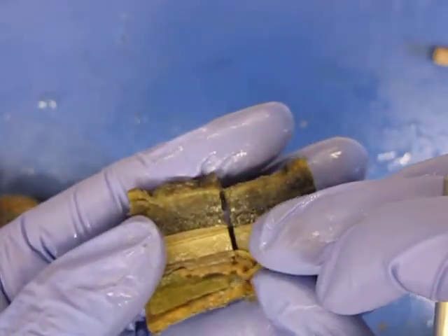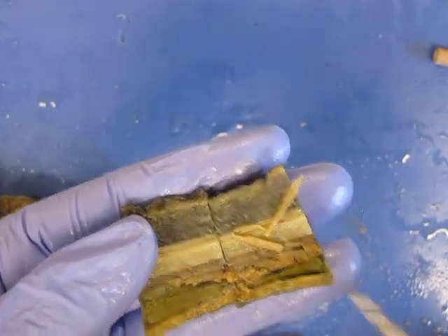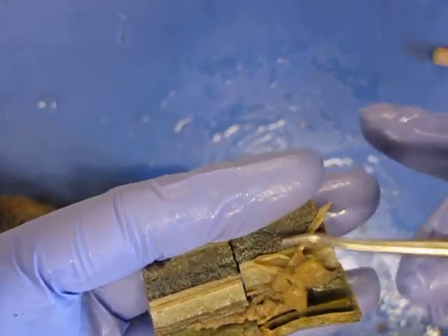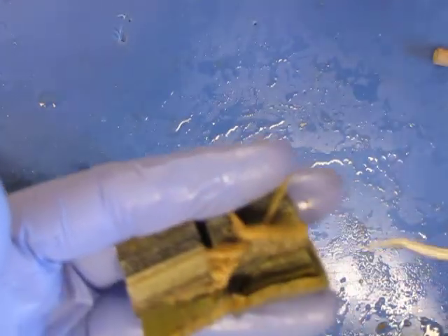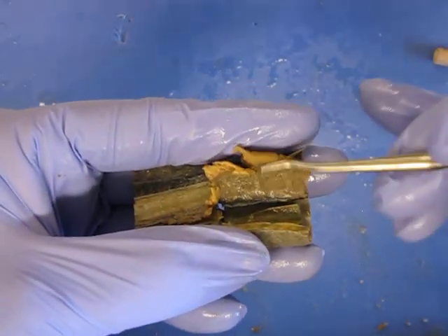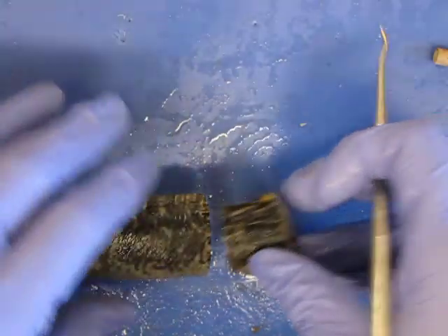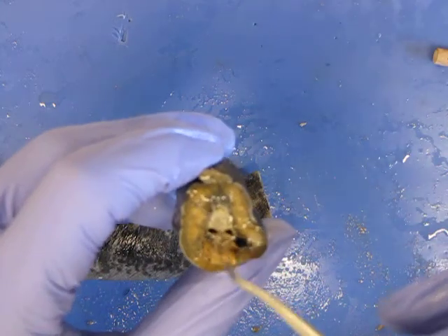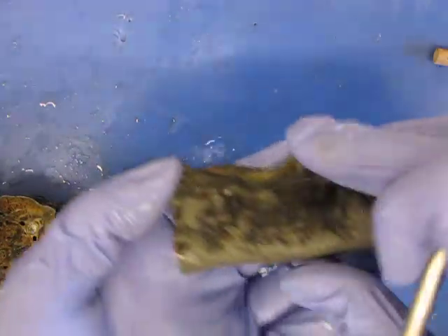So I open that up, it's intestine right there. You see the ridges. If I open that up, you can kind of see, much different than the ovaries and eggs. It looks just sort of globular. It comes off the dorsal aspect of the pleuroperitoneal cavity in a similar way that the ovaries do, but it just doesn't contain the eggs. So it's actually testes here. So those are testes. Liver you no longer see, so you get testes, intestine, blood vessels, notochord, spinal cord, hematopoietic tissue. Keeps going down that way.